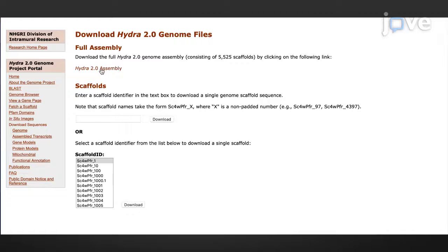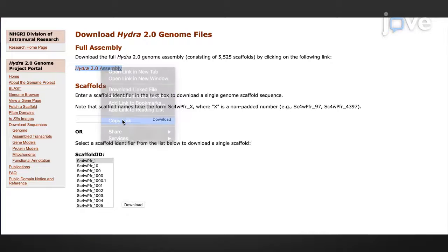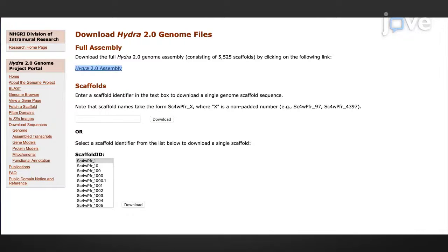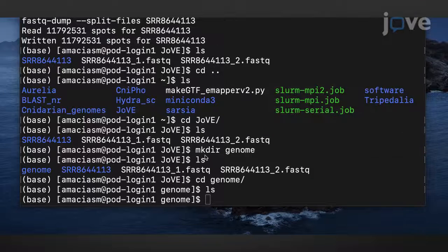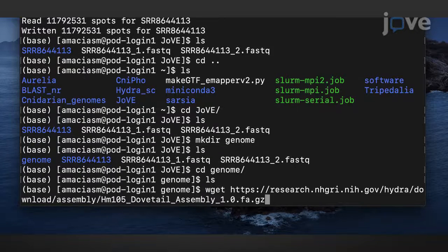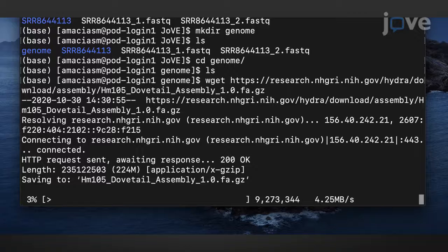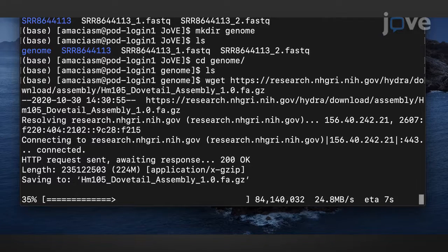To obtain a reference assembly, type WGET in the terminal window and paste the link address. If available, also copy the GTF file and ProteinFastA file for the reference genome.